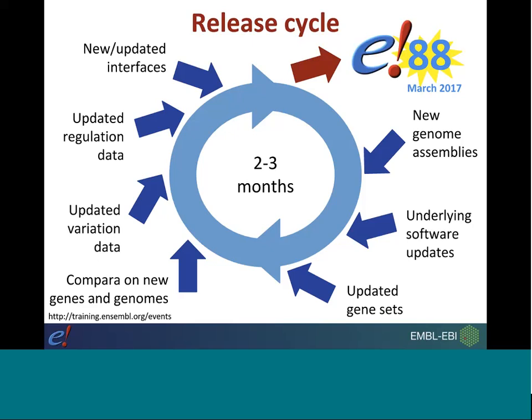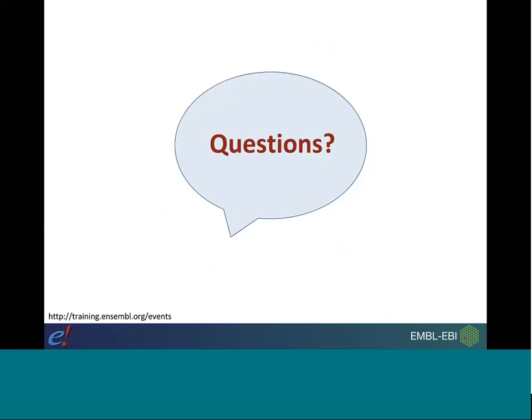We're currently at Ensembl 90, and I'm going to show you how to access the older archives as well. If you're working with Ensembl, it's quite important, I think, to make a note of the version that you're using, as when you go back to it in a number of months' time, you can always access the data as you would have seen at that time, if it might have changed in the meantime.